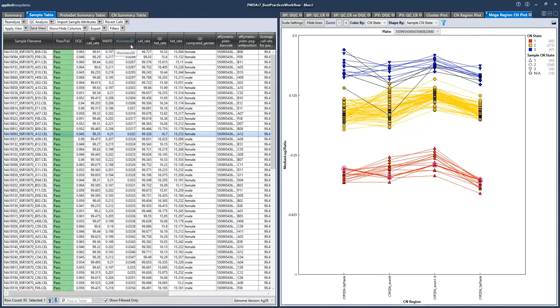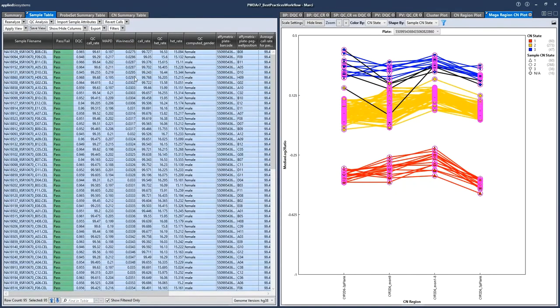In this data set, my samples are all passing the QC metrics, so I can just select all of the rows. If I had any samples that were failing, I could exclude them with a control click on the row or by not selecting the row. But in this case, all samples are passing, so I am selecting all of the rows. These are the samples I want to include in the next step, which is running the copy number discovery workflow.